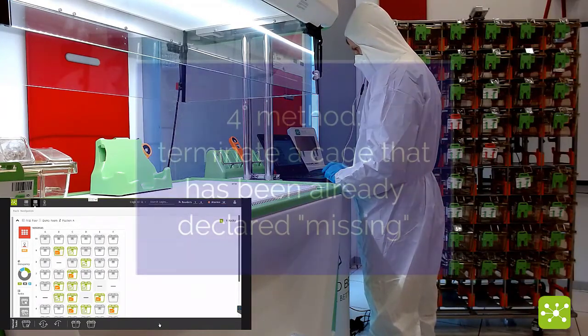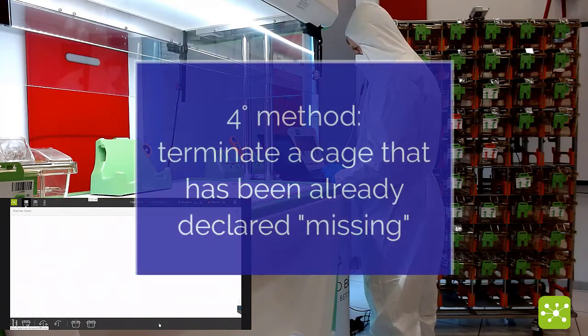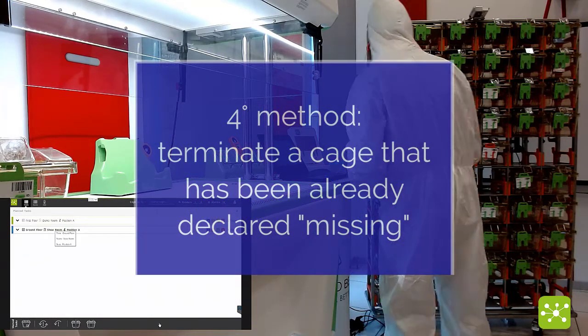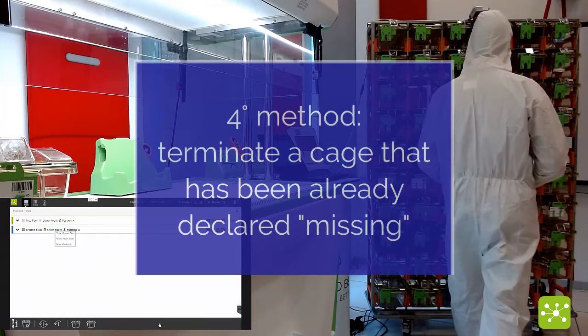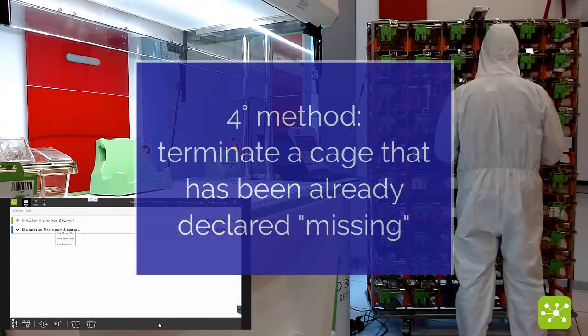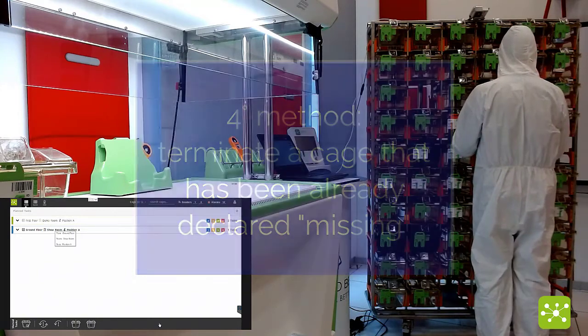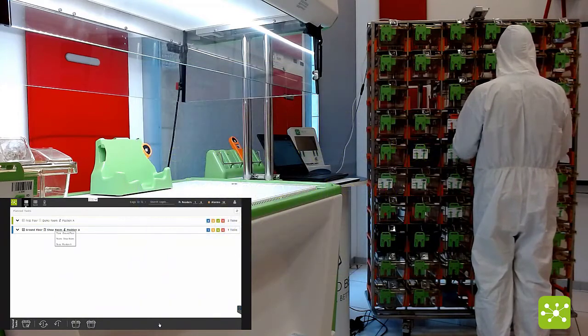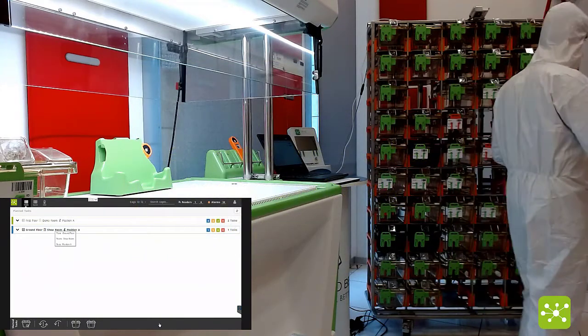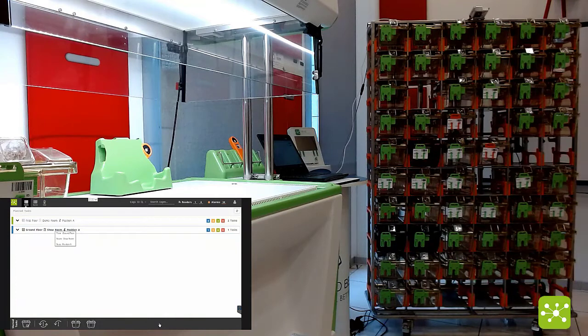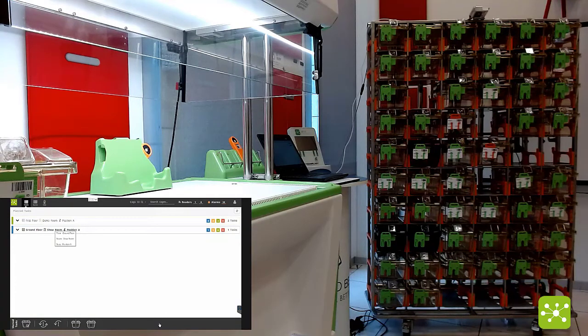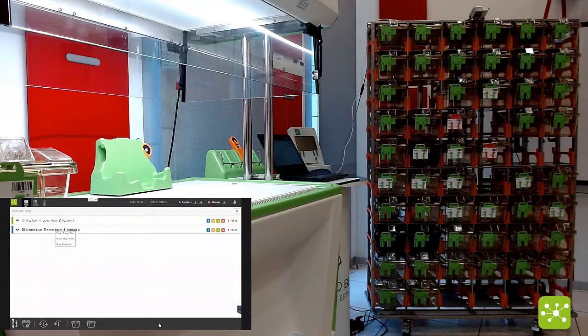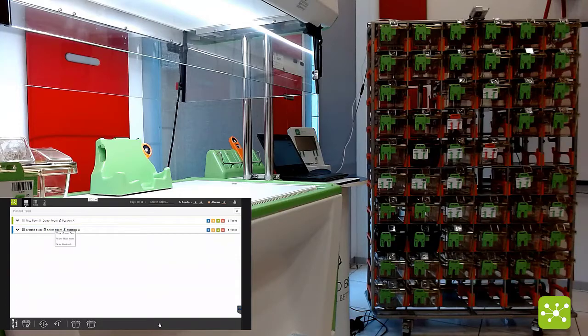probably one of the most convenient ways of terminating cages is simply extracting the cage you want to terminate without interacting at all with the DVC system and simply moving away these animals.